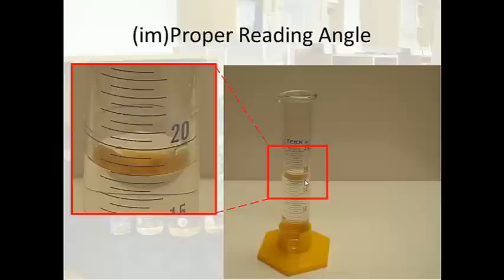It's really difficult to read a meniscus when you're above it. If you're at an angle, a normal angle from the tabletop, you can see here that it's really difficult to tell where the meniscus actually is. Is this the meniscus down here? Is this it here? Is it in between? So when you actually read a graduated cylinder or a beaker, any glassware as a matter of fact, you need to get your eye to the level of the meniscus in order to read it properly.